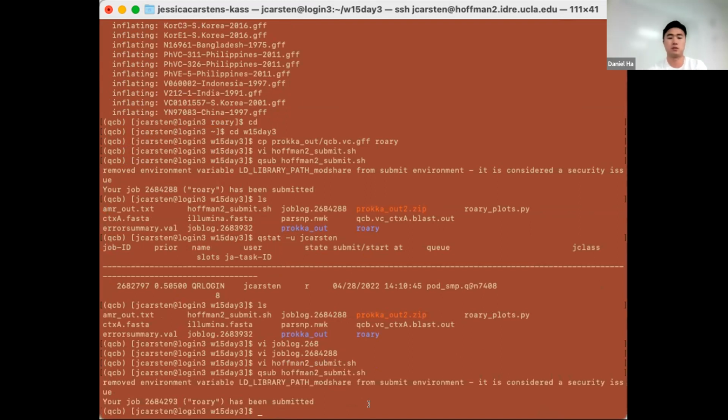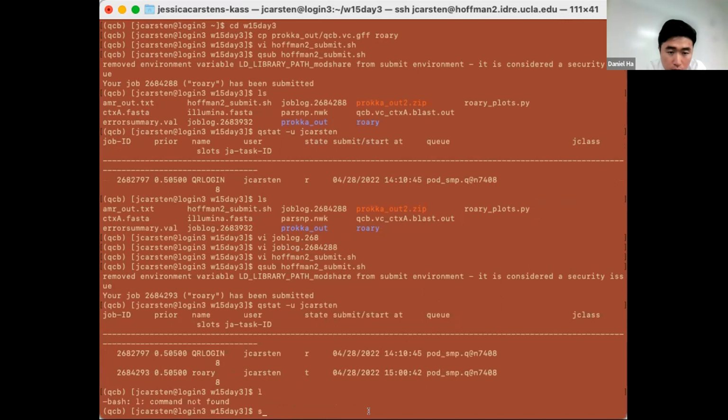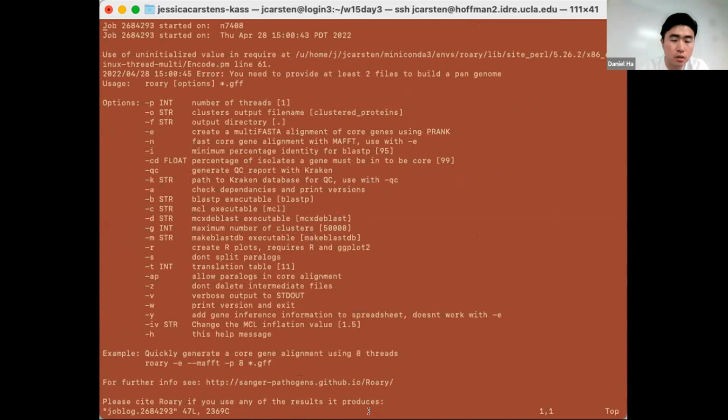Yeah, I changed it before and it started running immediately, and it stopped immediately, so something is probably wrong.